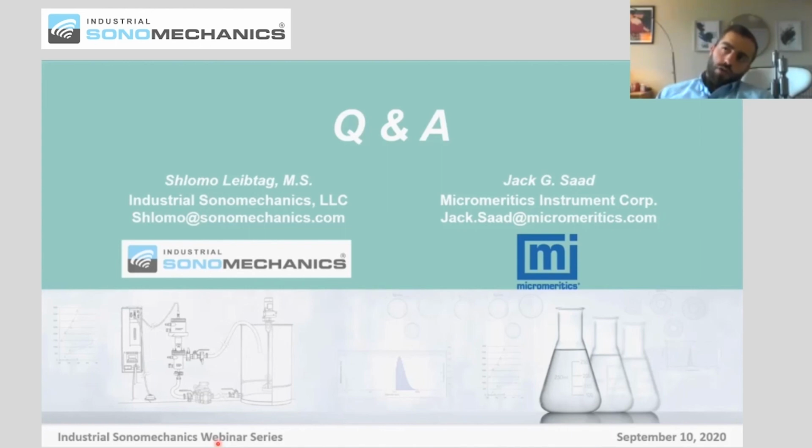I think they're referring to nanostabilizer, right, Eva? Yeah, I believe so. So for emulsions made with nanostabilizer, the order of insertion doesn't matter as much for the final value. It may take longer if you mix all things in a weird order, but eventually, if you provide enough ultrasound, you should achieve the particle size that is dictated by the ratio. So what I'm saying is that if at 5-to-1 you get to 20 nanometers, and you made a 2-to-1 that is at 150, and then you added 3 parts, you should get down to 20 nanometers.